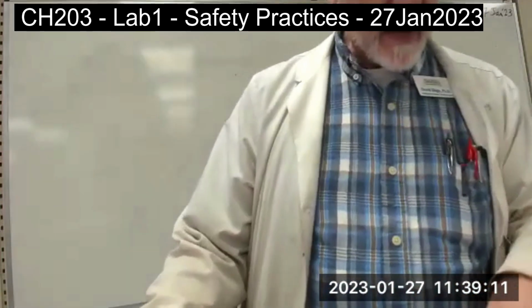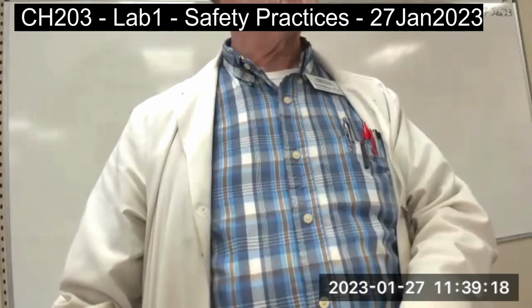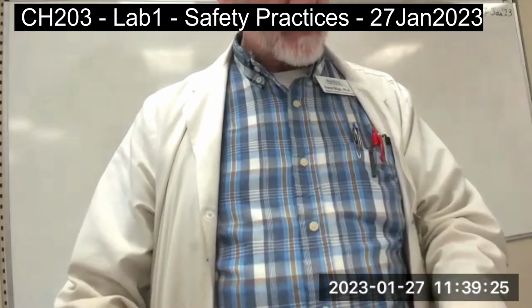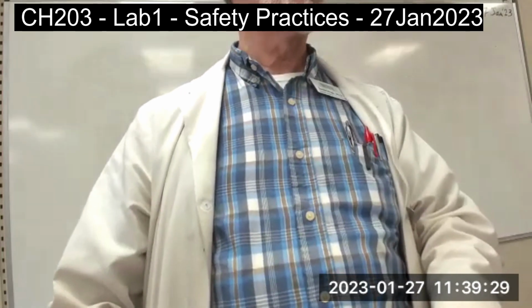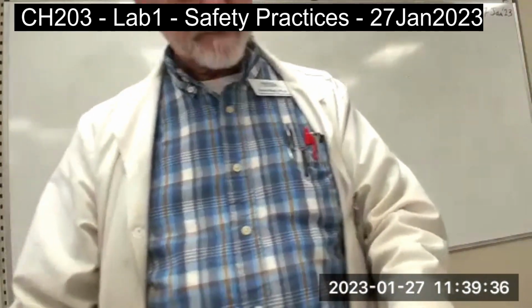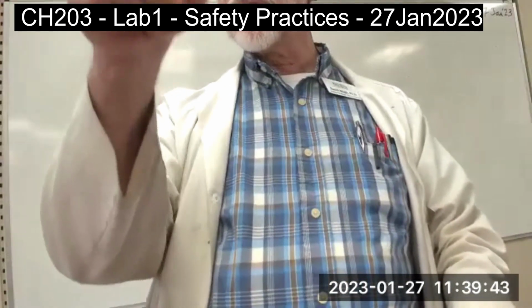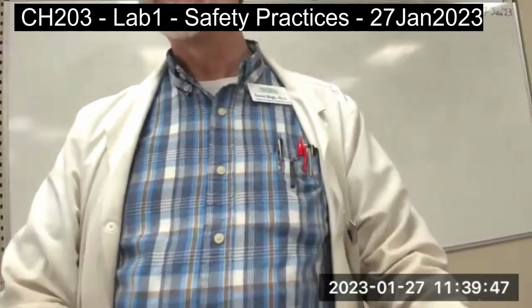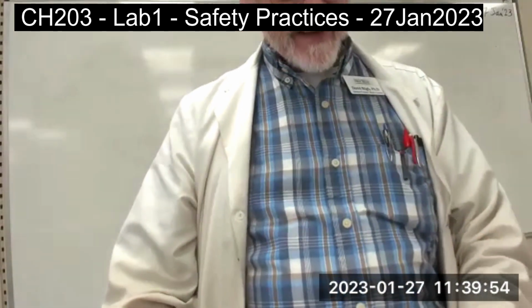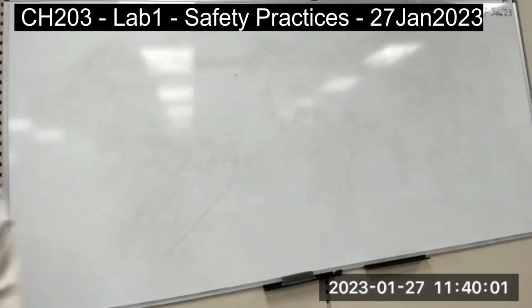Back to this, fire exits. Eye wash fountains, northwest corner. Fire extinguisher, west wall, I would say. First aid station, northwest wall. Fire blanket, west wall again. Material safety data sheets, northeast bench. It's over there in the corner by that barometer that doesn't work. That wooden thing. Nearest telephone. Well, it used to be over there. Now it's on the speaker's podium.